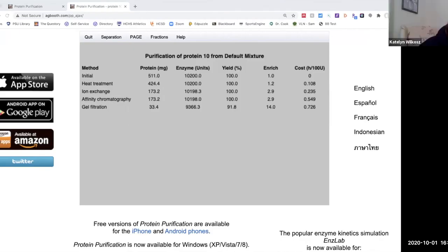Hey, Dr. Parente, do we use the default mixture? Yes, use the default mixture. Otherwise, Hayden tried doing this this afternoon. He used the custom mixture, but I think that has 60 proteins in it. So I said, you're fine to stay with that one, it's just going to be much more complicated because you've got to separate your 1 from another 59. So the default mixture is better.